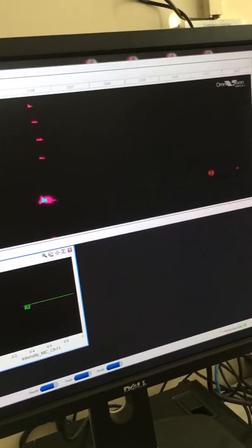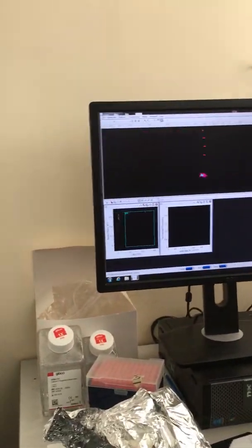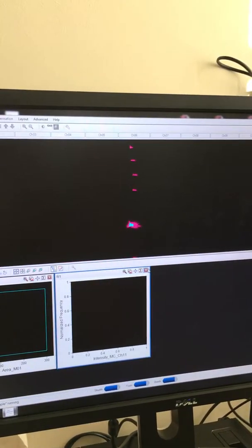But for now, let's just unlink those. Load next sample. So now R2 and R1. You're going to collect 1,000 of R1. R1, yeah. Okay.